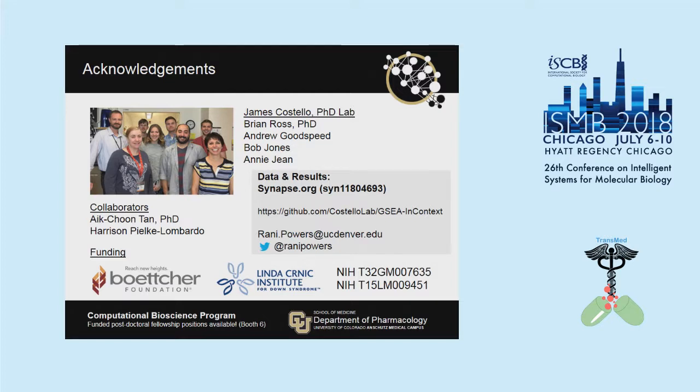So I used the raw microarray data in the form of CEL files, and I analyzed them all with the same bioinformatics pipeline, using just some standard R packages like affy and limma. I did RMA normalization. In the paper, we talk about the consistent normalization strategy that we used, but really starting with the raw CEL files allowed us to use that same pipeline, using only experiments with the same microarray.